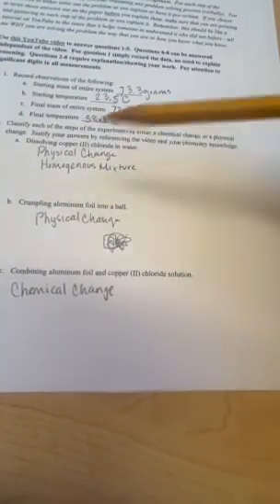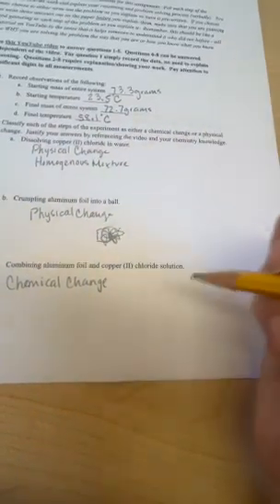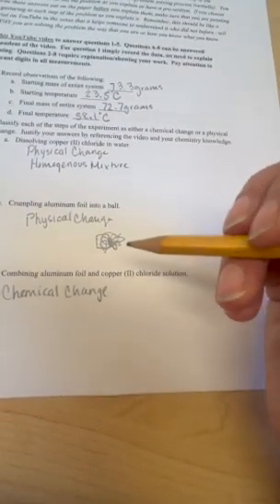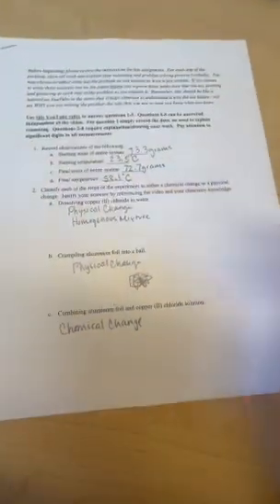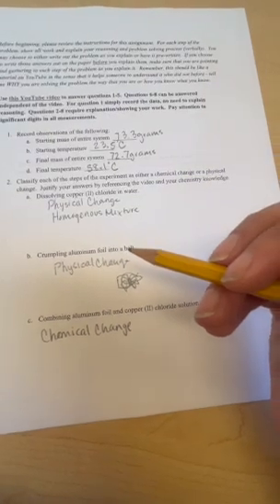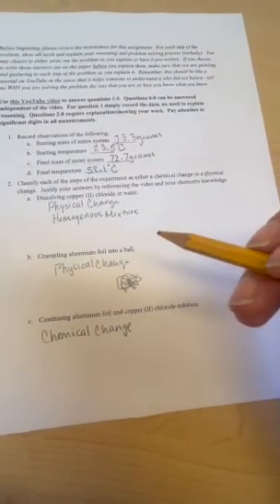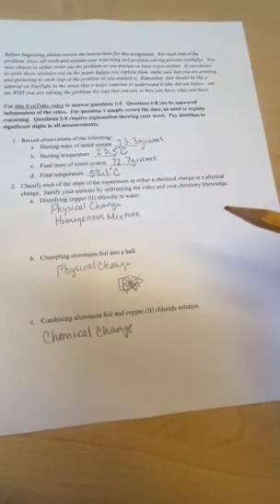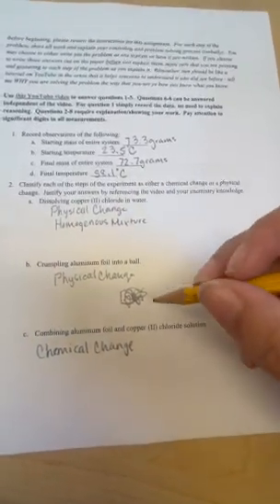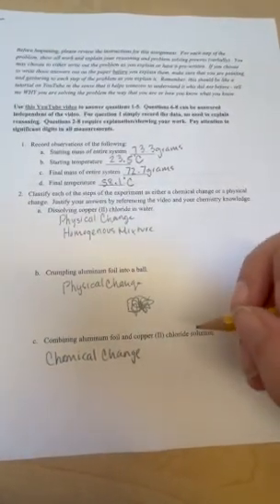We started getting some bubbling. We got some sort of smoke, vapor-like substance being let off from the top of it. We had some color changes, and these are all classic indicators of a chemical change taking place.